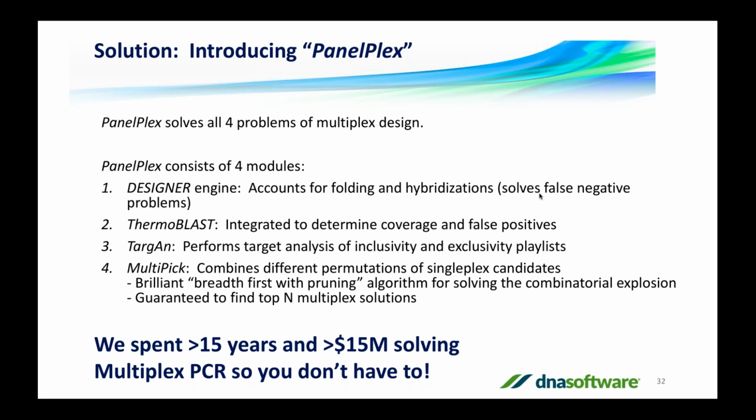All right, it's not approximate, it's guaranteed. Now, also, I want to say this. I can brag about this algorithm because I'm not the one who invented it. This was invented by my team, who I'm very proud of. They used a breadth-first pruning algorithm to solve this combinatorial explosion, so it's computationally tractable. All right.